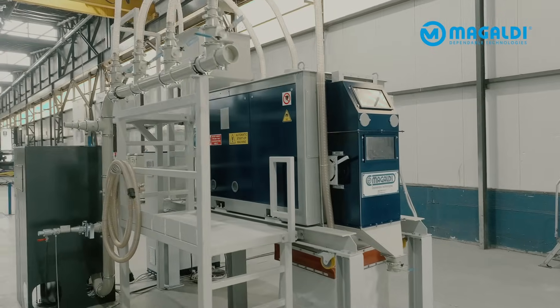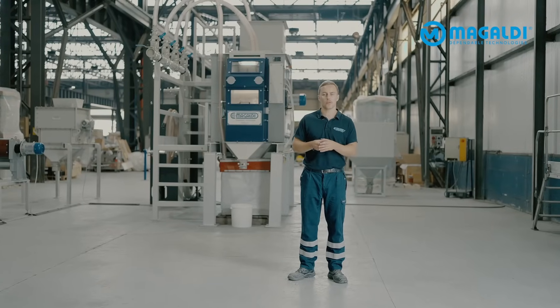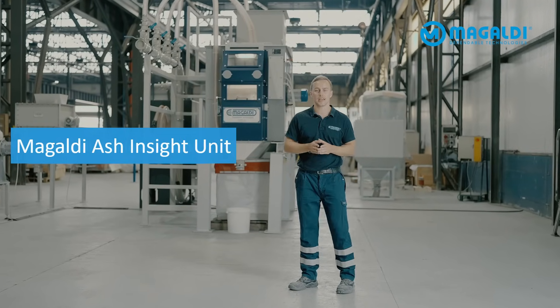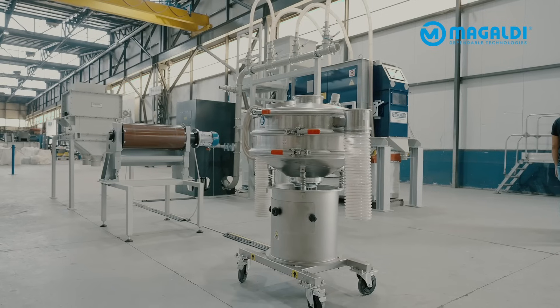Hey everyone, today we are proud to introduce to you something that changes the way you think about ASH analysis. This is the Magaldi ASH Insight Unit, our first ever mobile test plant.